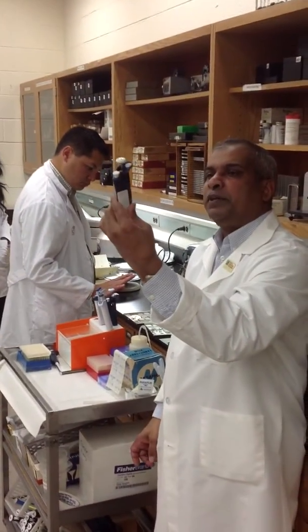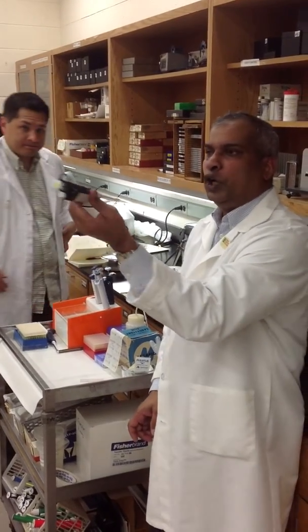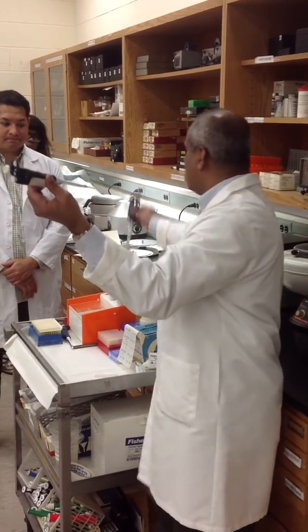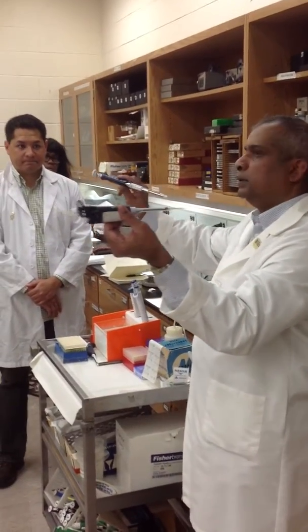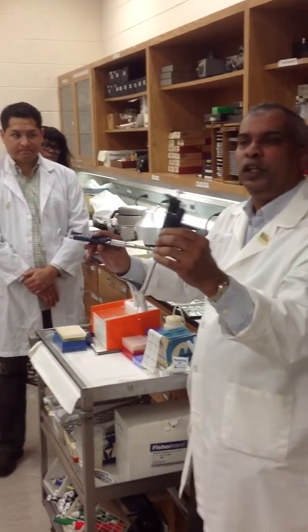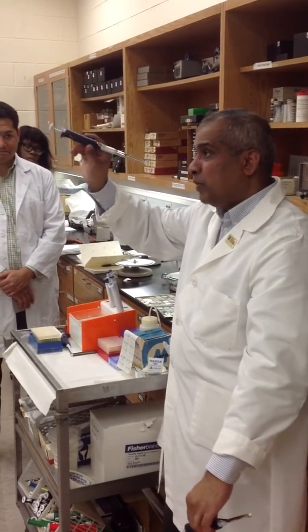So this is your pipette, right? And it says 200. 200 means what when you see the 200 there? As opposed to this one says 1,000. What does that mean? Microliters. So this can only measure up to 200 microliters. This will go up to 1,000 microliters.